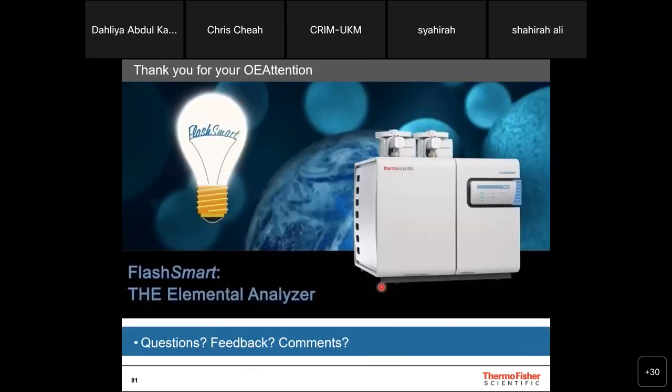With this, I will stop my discussion. This is the technology of the elemental analyzer I want to share with you. It gives you some insight into how we can use this to create a project, be it a project to monitor environmental pollution or to apply this technology or instrumentation in industry. I hope this gives you a good overview of the elemental analyzer.